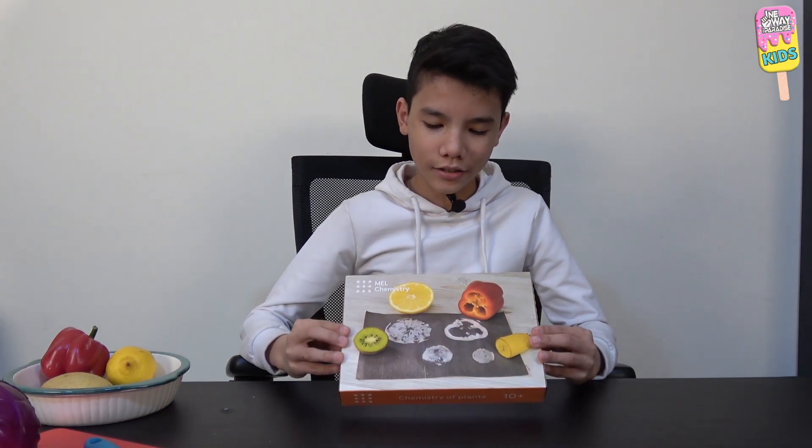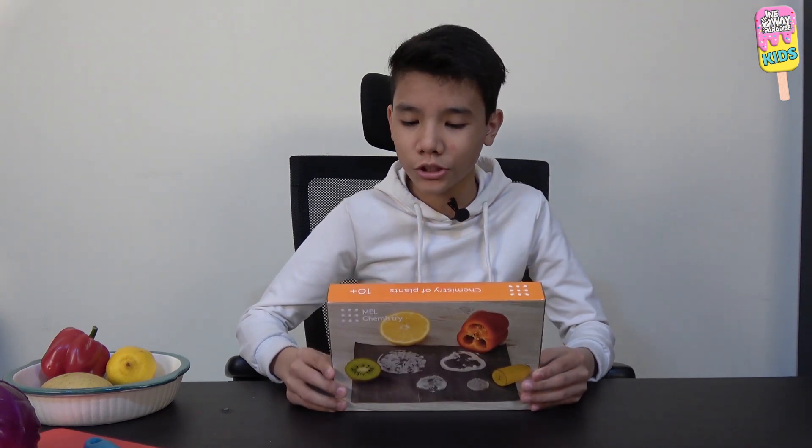This is our second package and it is the chemistry of plants. It contains three experiments and the first one we're going to be doing today is anthocyanins, but first we have some things to prepare in advance.